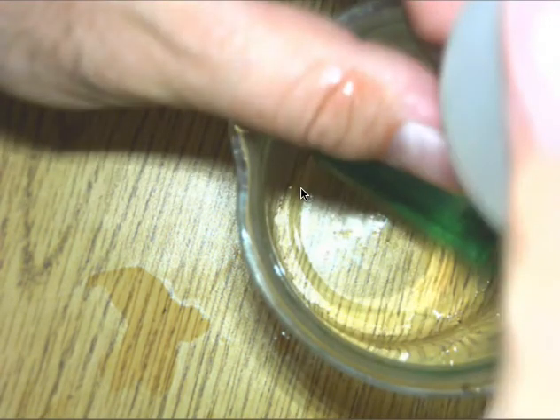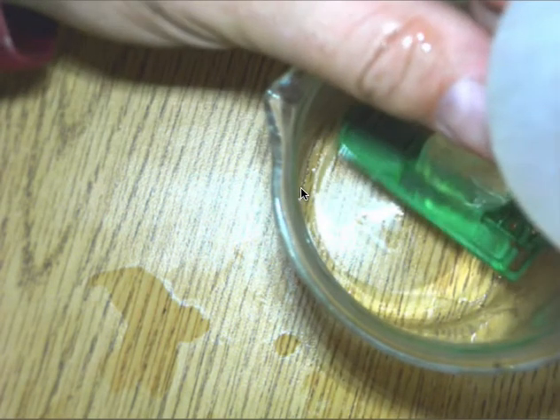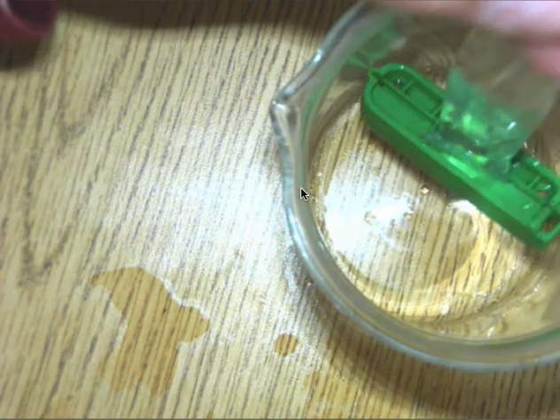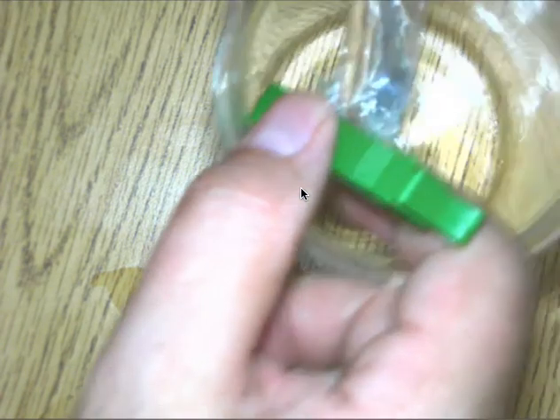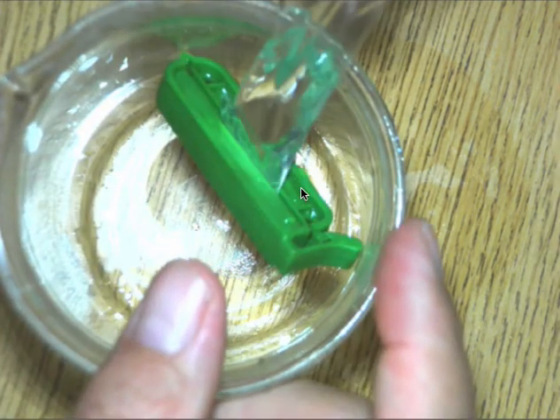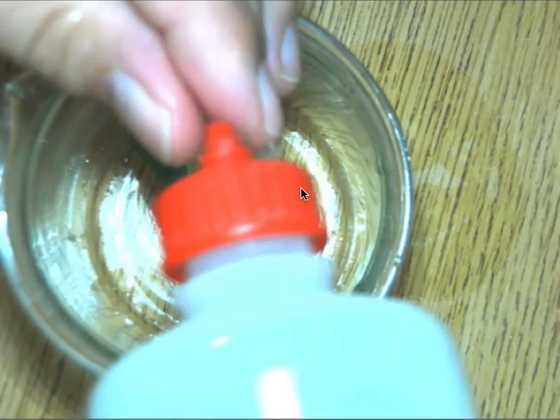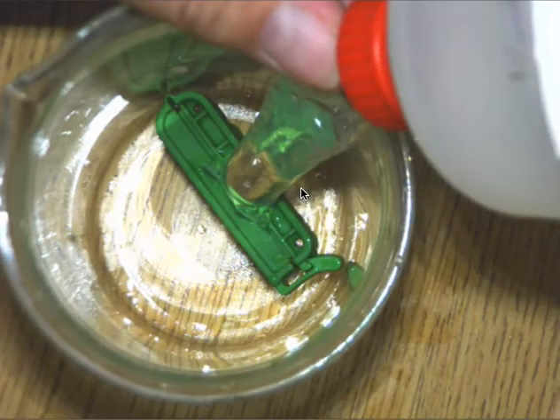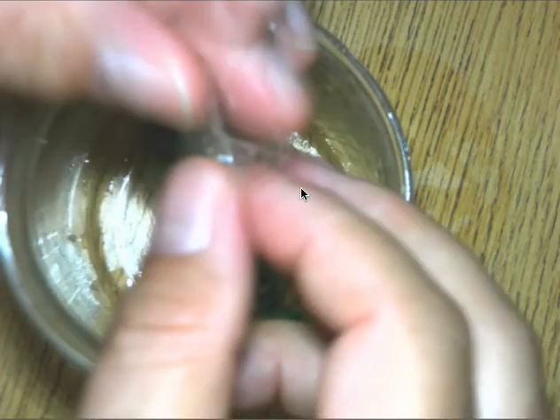Place it in and add. And so we're going to kind of spitball it a little bit here, about 2 fingers lengths. So now you can see here we go. We've added starch. Now it asks for glucose. Add some glucose here.